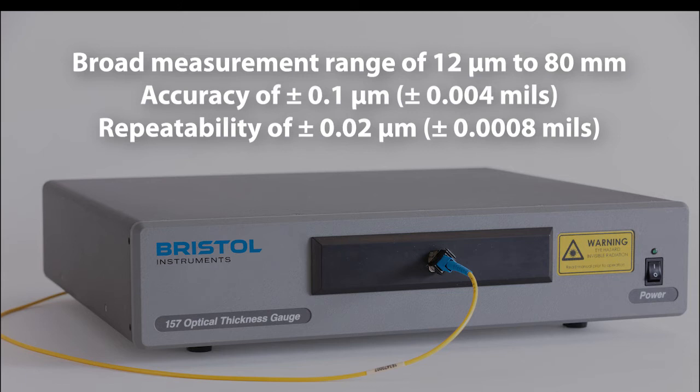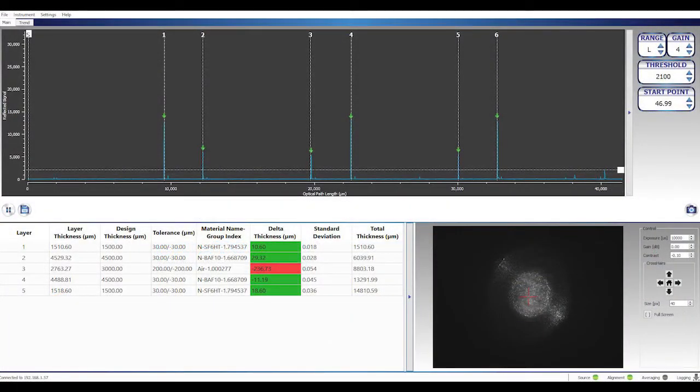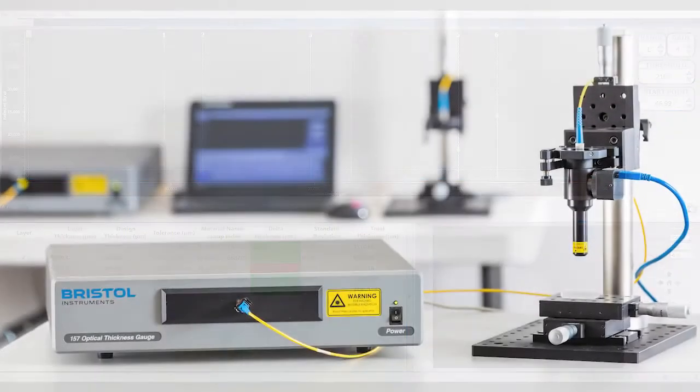Rugged design, straightforward operation, and production-ready software features allow for easy integration and use in laboratory and manufacturing environments.